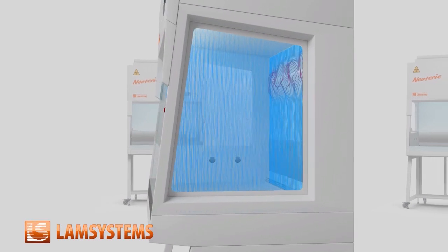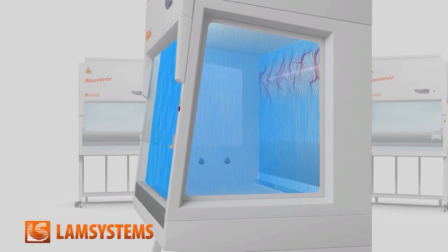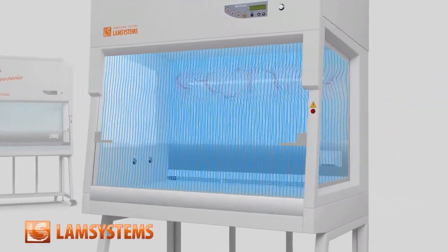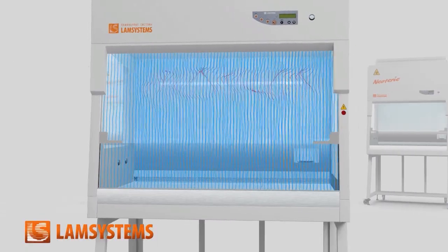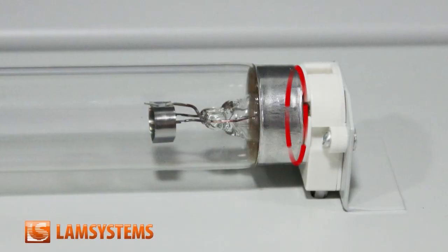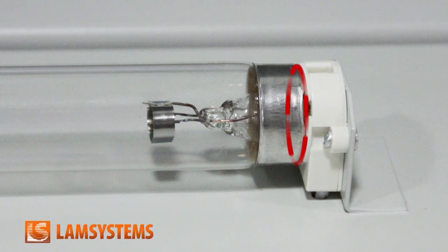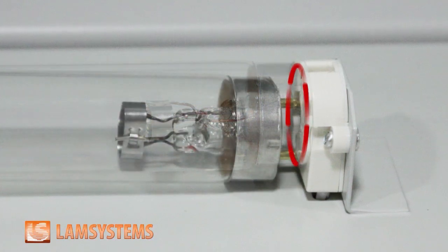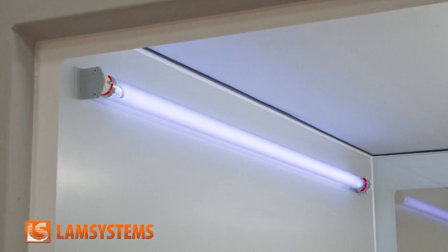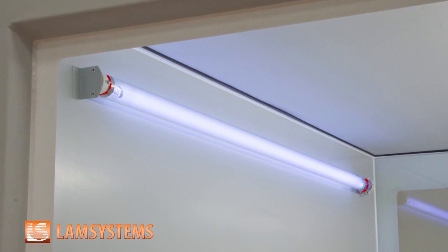But let's have a look what happens with the laminar airflow when there is an obstruction. This is the ultraviolet lamp that can be such an obstruction when placed in the working chamber. Going around it, the airflow becomes a turbulent one and is able to cause the product cross-contamination. And this is only one disadvantage of this ultraviolet lamp position. The lamp attaching points are also places where hazardous microorganisms can accumulate. Besides, these places are difficult to disinfect properly. That's why many manufacturers stopped installing an ultraviolet lamp into a working chamber.